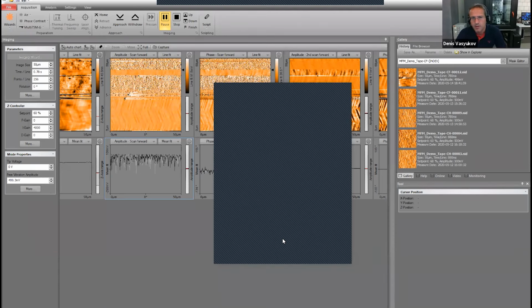The samples, again, really depend on what samples you measure and what you would like to see in them. Most magnetic samples have some sort of remnant magnetization. So you could magnetize them with the magnet, then remove the magnet, and you will still have some magnetic structure on the surface inside the sample.